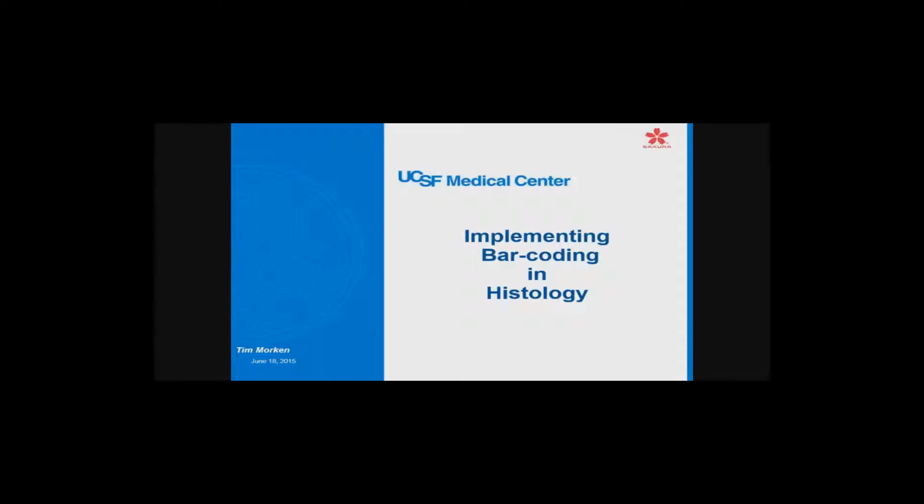I'm going to go through a few slides that reiterate the advantages of barcoding in the laboratory, but for the most part, we're going to talk about what the process is of actually doing that rather than all the benefits of it. One thing about any kind of software process is that every laboratory is going to be different. A small laboratory with half a dozen people is going to be a lot different than a large laboratory with 30 people. Resources will be different, the type of software you pick may be different, the path you take will be different, and there's really no set path. So I'm just showing you what you want to consider rather than giving you a definite roadmap.